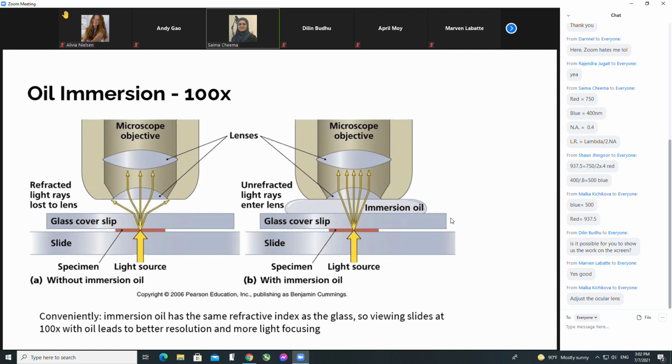Yes, Olivia. Sorry, just to clarify, so for 4 times magnification, it's coarse, 10 is fine, 40 is fine, and then right before 100, in the middle with them sticking out side to side, you put the oil and then you switch it to 100. Yeah, and then you swing in 100, yes. Got it. Yep.